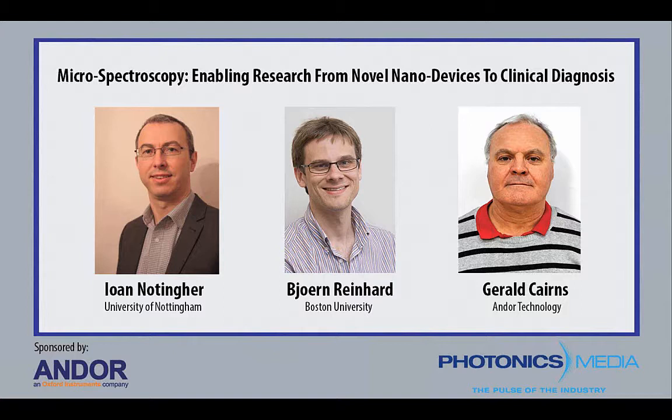Oh yes. Micromanager is software used quite widely by microscopists, and it's popular freeware. What has been developed are plugins that allow spectroscopy to be carried out using it. These plugins allow you to control the spectrograph, control its setup, and control multi-dimensional acquisition. So if you wanted to configure your microspectroscopy system to do two-dimensional Raman mapping, for example, a 2D scan, that can be handled by Micromanager now. So it's added functionality to that widely available software package.